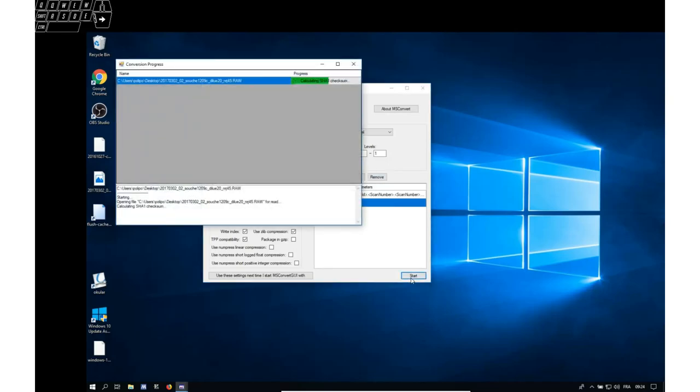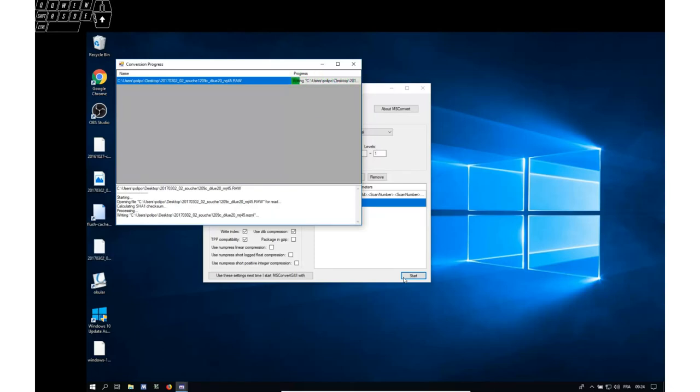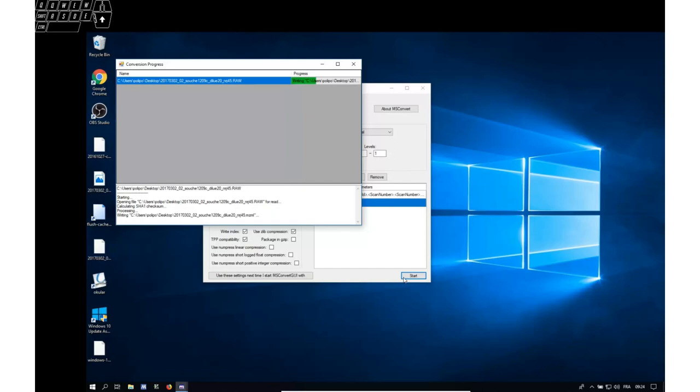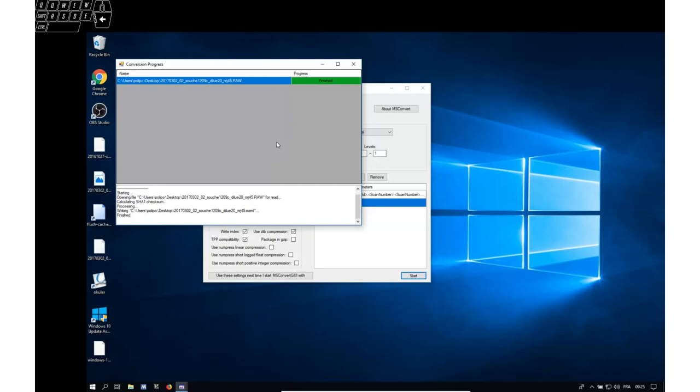Start. This conversion may last a long time, either if you have a small number of processors on your machine, or you have many files to convert, or the files are very large. So let's run that process to the end. And you can see that the file was properly converted. That is done.